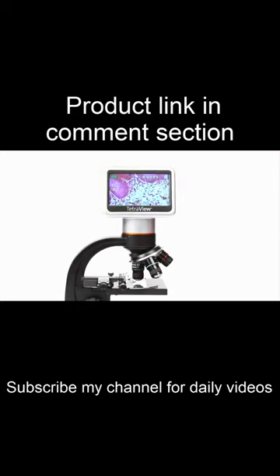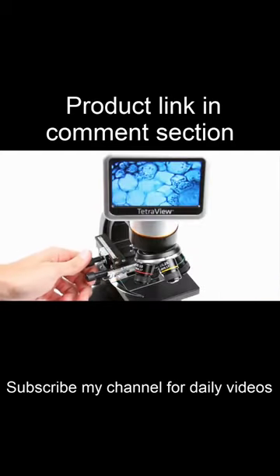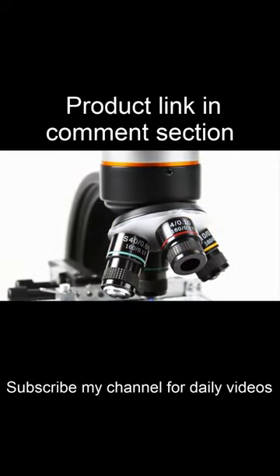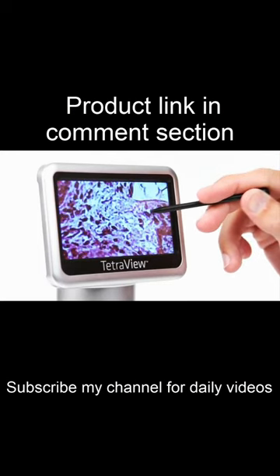Capture images and video with the built-in 5-megapixel sensor, and save them to the included 2-gigabyte SD memory card. This lab-quality microscope features four achromatic glass objectives on a rotating turret, plus a 4x digital zoom, so you can achieve up to 1600x magnification.